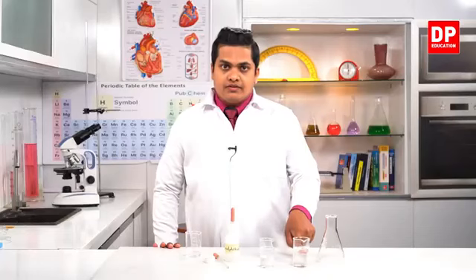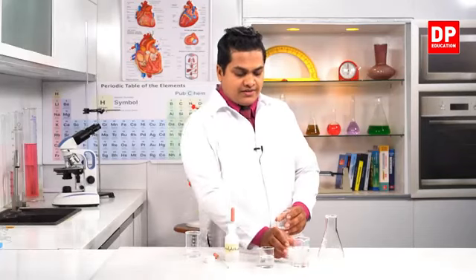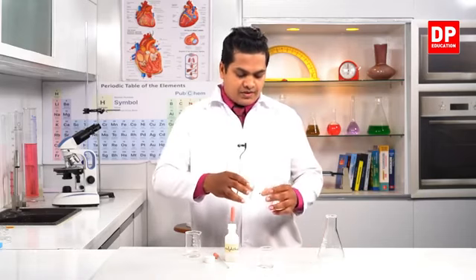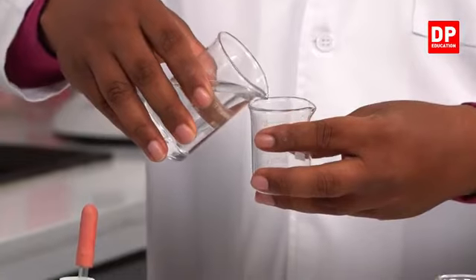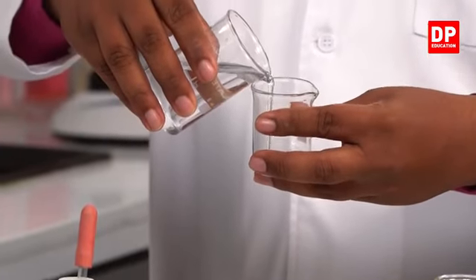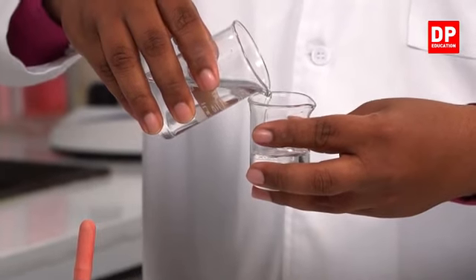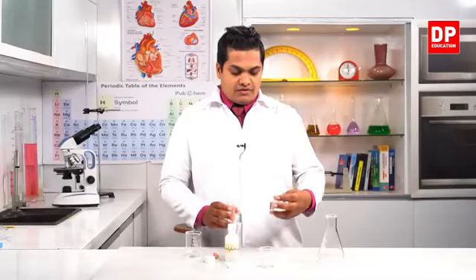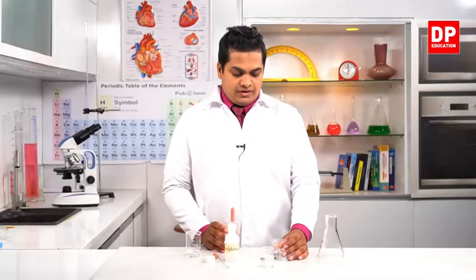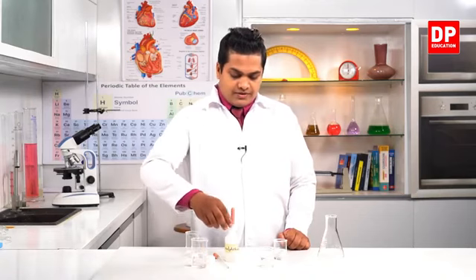Then we'll take HCl and measure some amount of it. Here we don't know exactly how much HCl is needed for this chemical reaction, so I'll add some amount of HCl here. Right then.